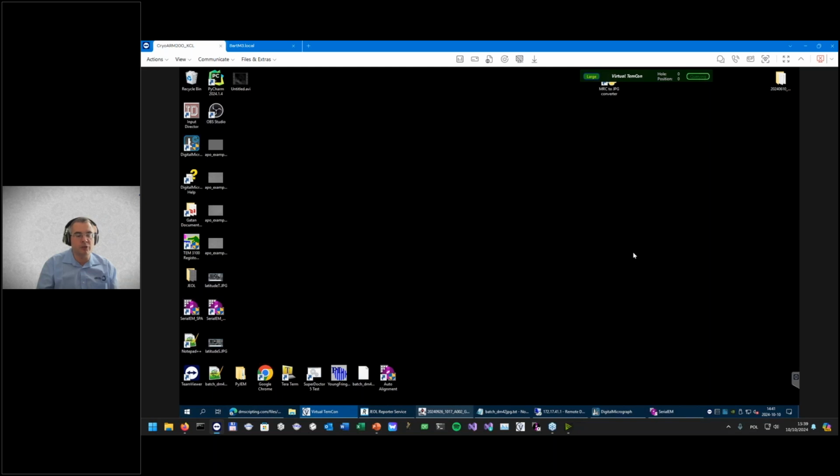So using TeamViewer from my personal PC, I logged in to the camera PC on that system. I am physically located in Krakow, which is probably 1,000 miles away from London, but I hope the experience will still be quite smooth.